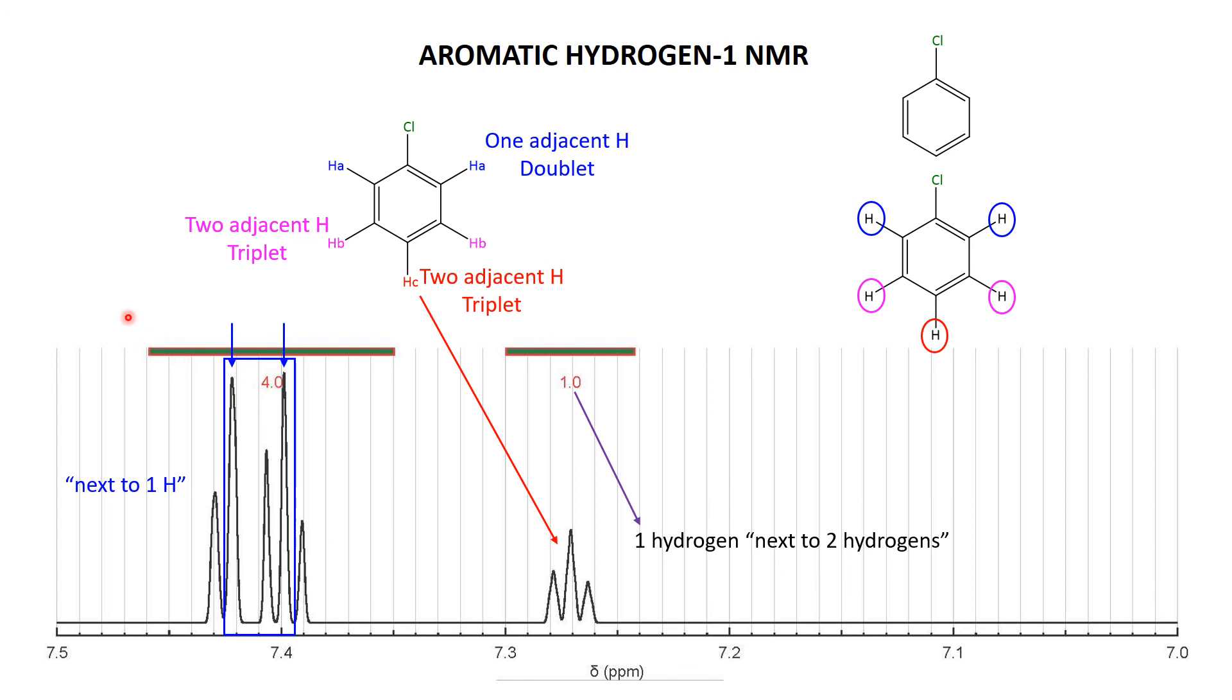Now what's left when we pull out that doublet is three peaks that are almost in a ratio one to two to one. Remember these things are not always exact. Although if you look at and match up this triplet with this triplet, you can see that it's the left hand one that's a little bit higher in both. So I'm going to say that those three peaks there match up quite nicely to the triplet expected for Hb. So those three peaks there correspond to two hydrogens that are next to two hydrogens.